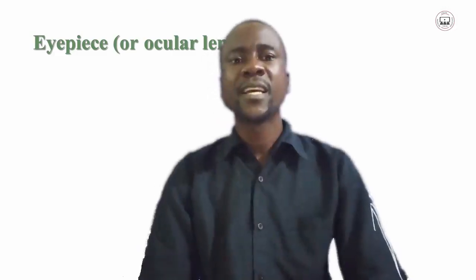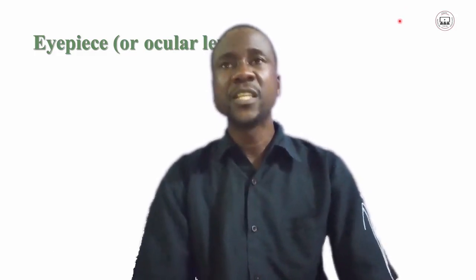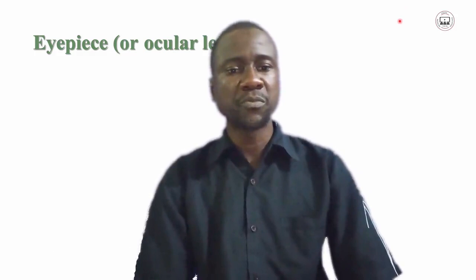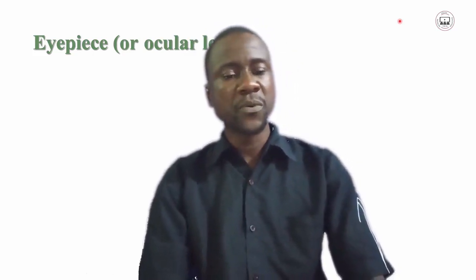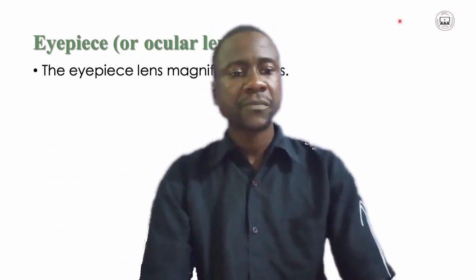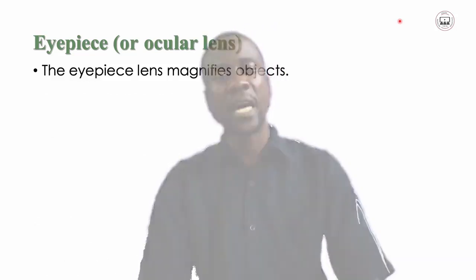Welcome back. I hope you have enjoyed the video lesson where you have seen the parts and their functions. And now I want to present to you a summary of notes from what you have just seen in the video. Now, the microscope, we have the top part, which is the eyepiece. The eyepiece, as the video was explaining, this could be the summary of the function of the eyepiece.